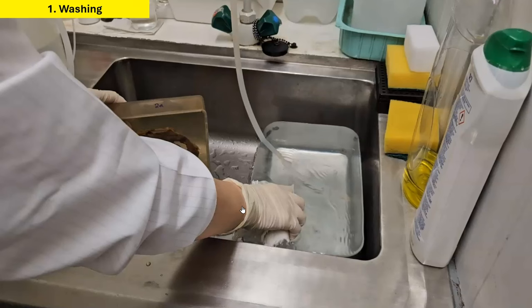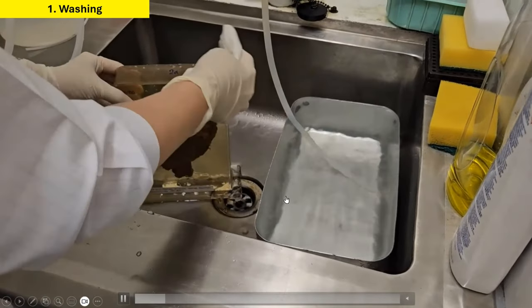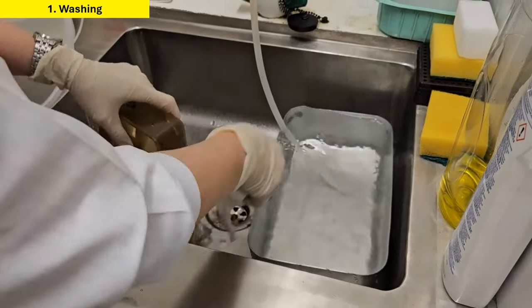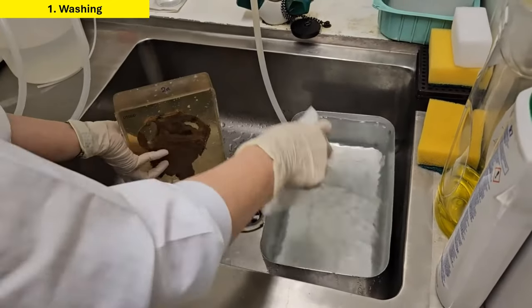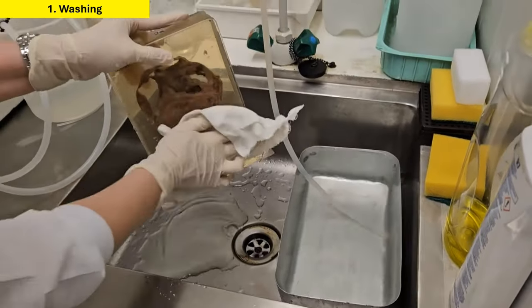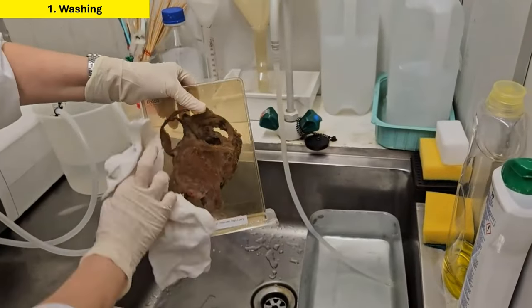The first step is washing. For this, we simply take a clean cloth, dip it in water, and thoroughly wipe all the sides of the specimen container. After cleaning all the surfaces, we then dry the cloth and dry the container. Once dried, it is ready for drilling.